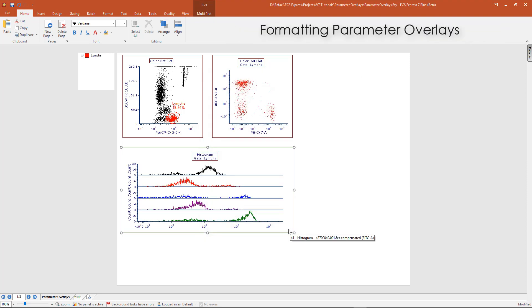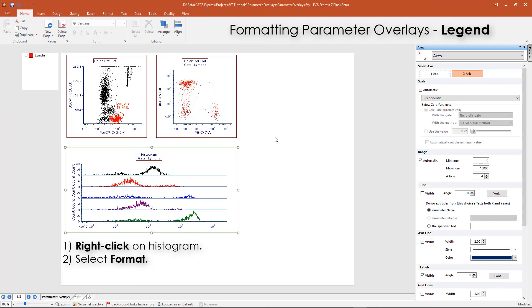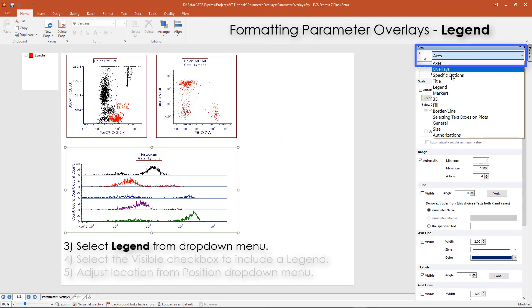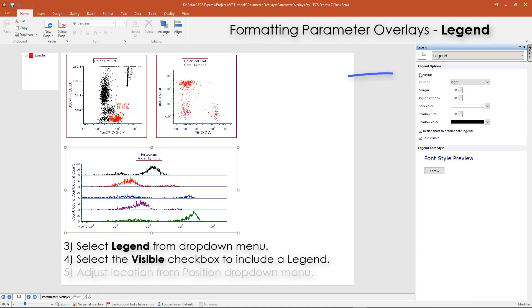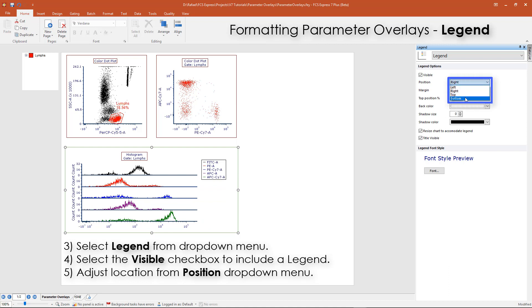Parameter overlays can be formatted to include a legend by right-clicking on the histogram and selecting Format. Then, from the Legend category, select the visible checkbox. The position of the legend can also be modified from the Position drop-down menu.